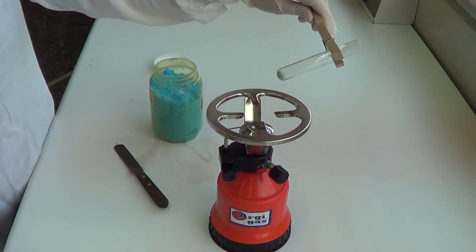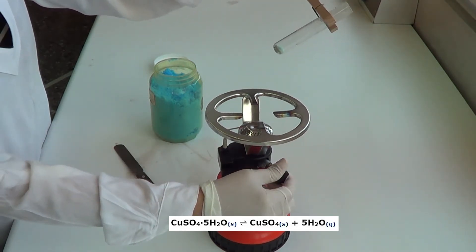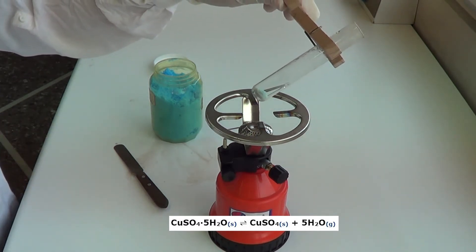We observe that during heating, the hydrated copper sulfate changes color from blue to white, while drops of water appear on the walls of the test tube.